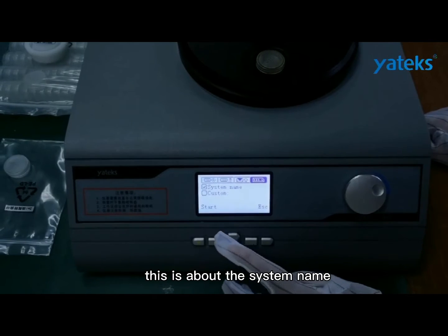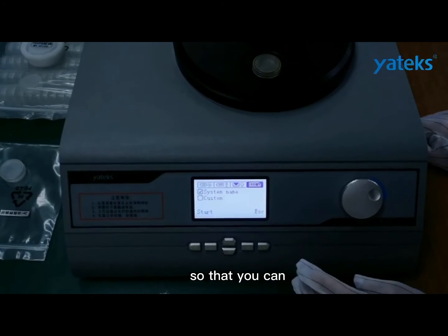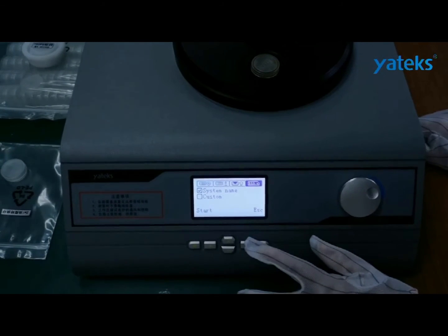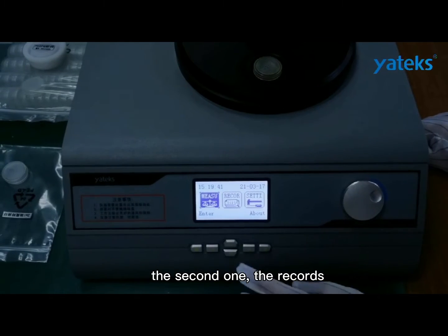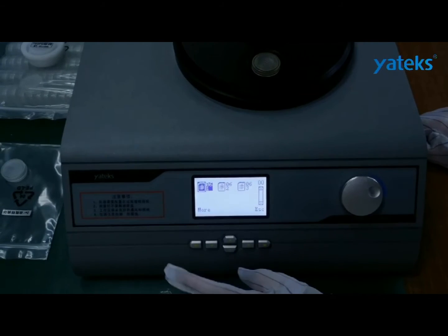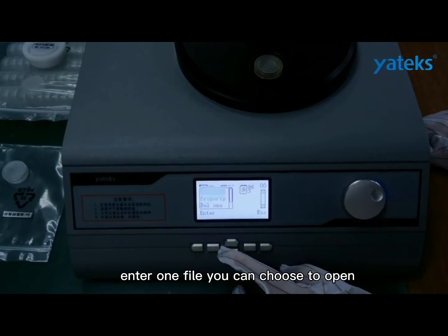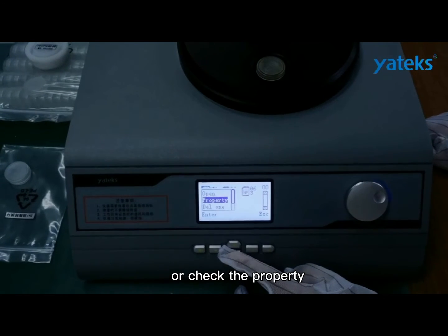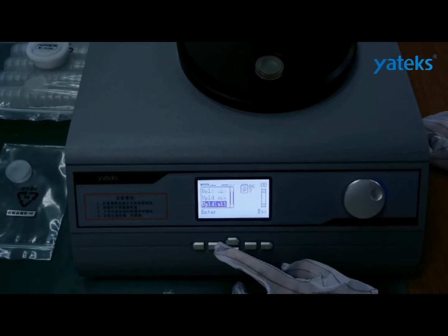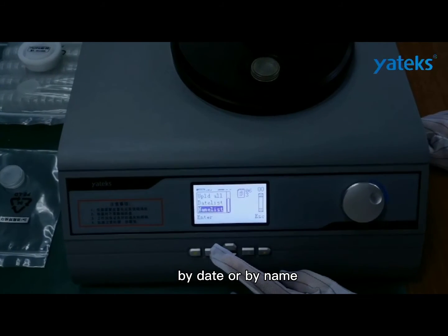This option is about the system name. You can customize it as you like so that you can recognize this instrument in your lab. The second option is records. You can check all the records that you have saved here. Entering one file, you can choose to open it, check its properties, delete it, or upload it. You can also choose to list them by date or by name.